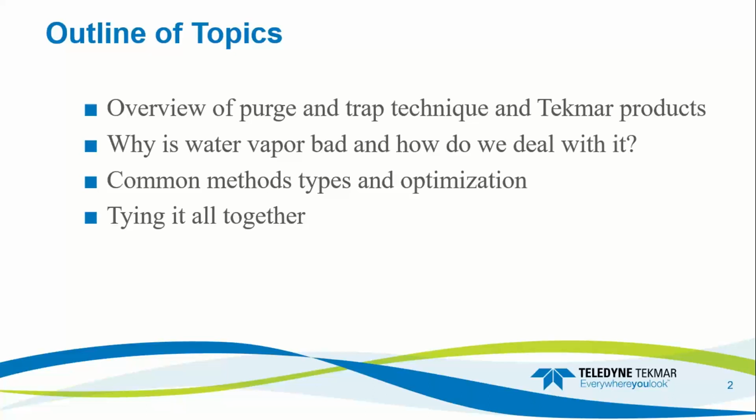We will cover a quick overview of the purge and trap technique and our products, why water vapor is bad and how we deal with it, common method types and optimization, and then we will tie it all together in the end and hopefully have time for a few questions if you have any.